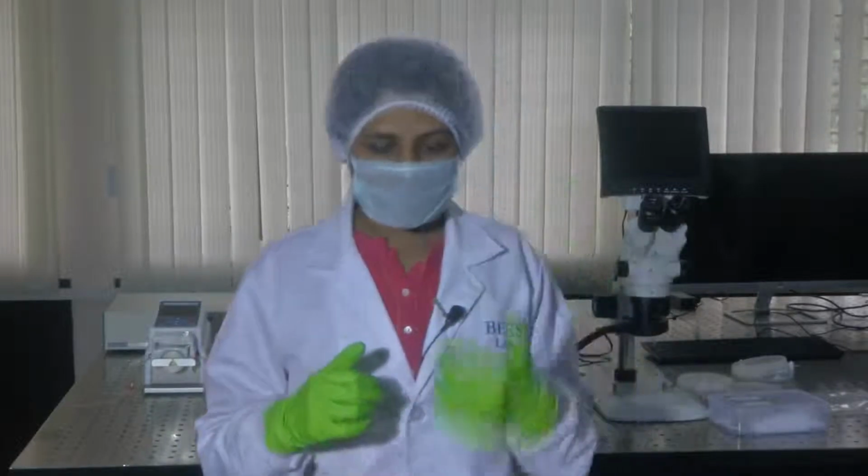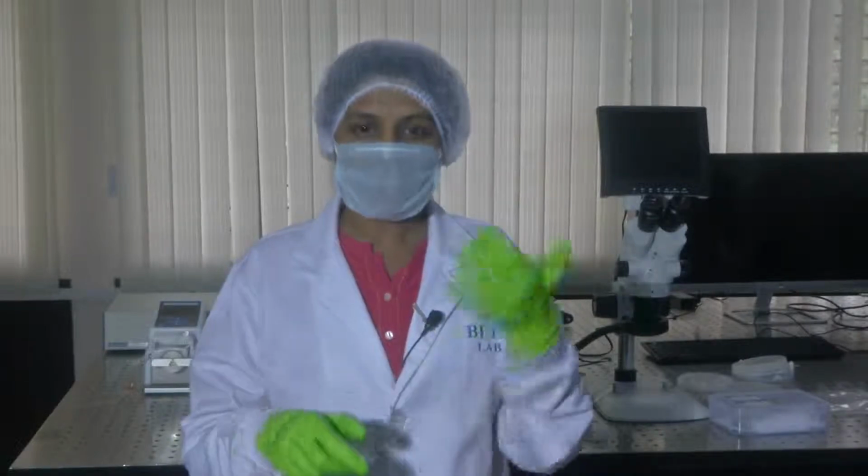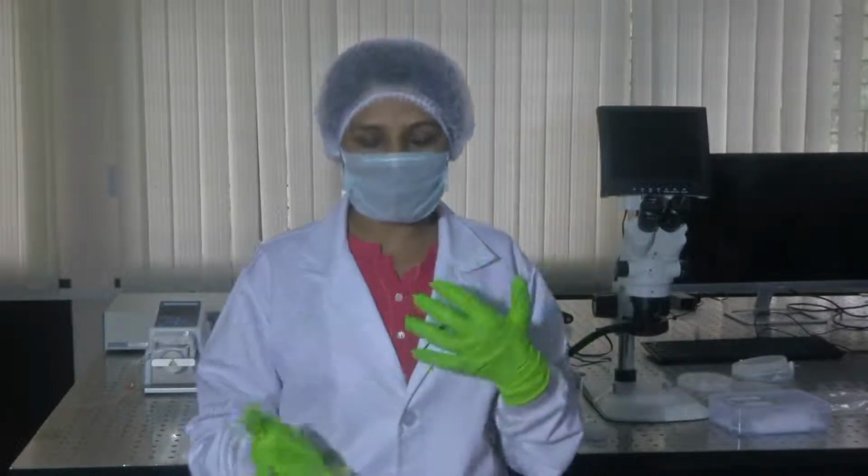In our case, we have these channels and we have fluids which have to be flown through them. That can be attained using a micro pump, the pumping mechanism.